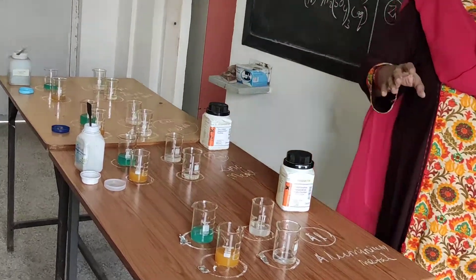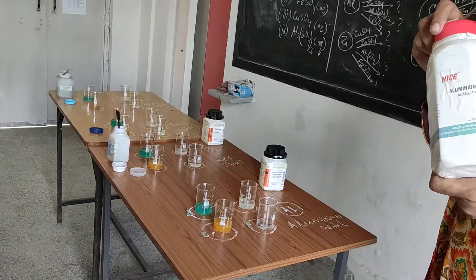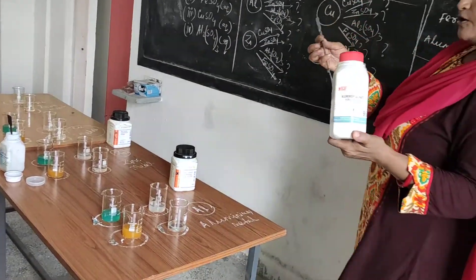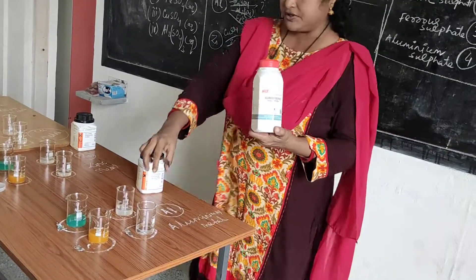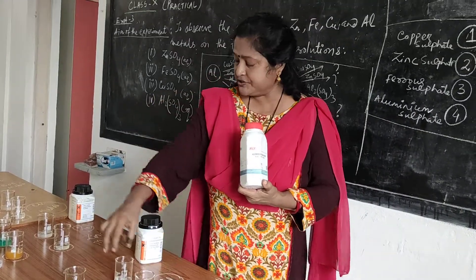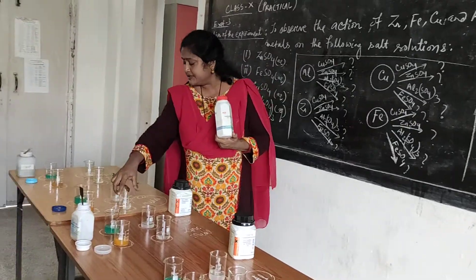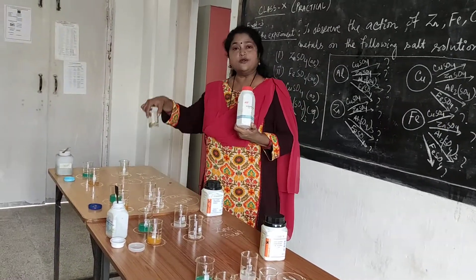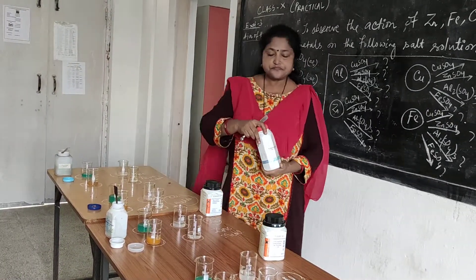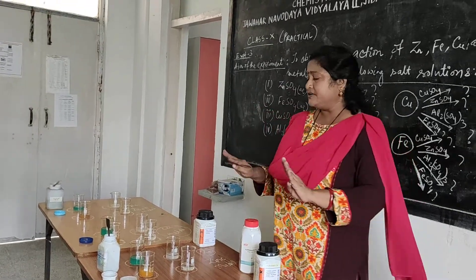The fourth beaker for each table is aluminium sulfate. I have taken aluminium sulfate solution — you are seeing aluminium sulfate solution at all four tables. Now all four solutions are set up.